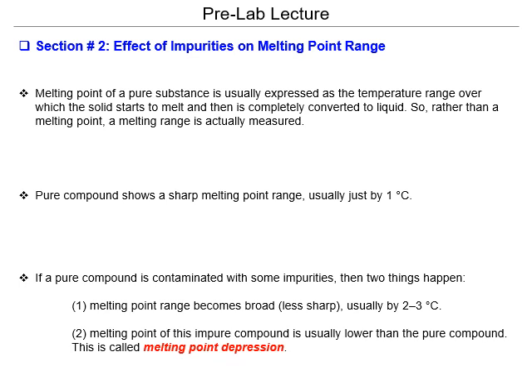When you're dealing with a pure compound, it's got a very sharp melting point, usually within 1 degree Celsius from the beginning of the melt to the end. But if you have a contamination or a mixture of different substances, the melting range definitely becomes broader, about 2 to 3 degrees Celsius to fully melt. It can even be longer depending on how many impurities or differences in the types of compounds you have together.